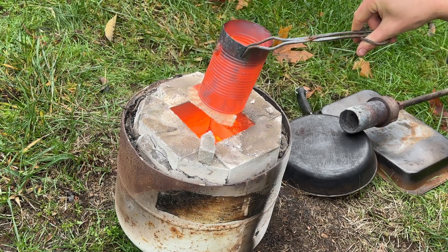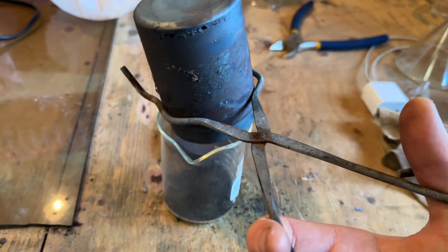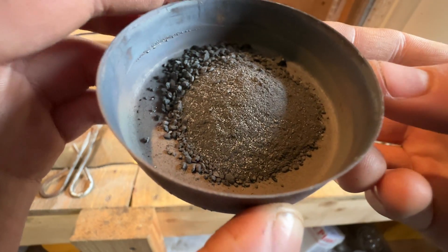Once finished reacting, the furnace was turned off and allowed to cool. Upon emptying out the cooled reaction mixture, many small spheres of tin are immediately identifiable.